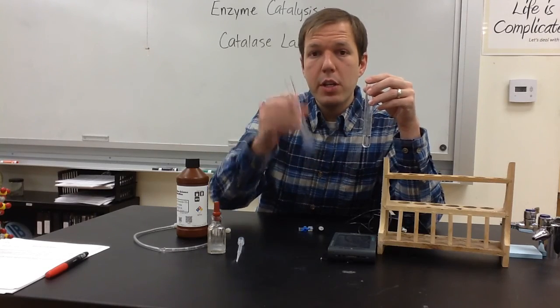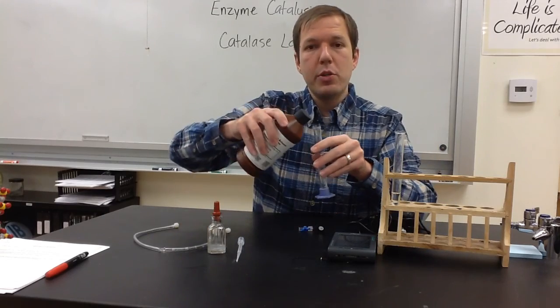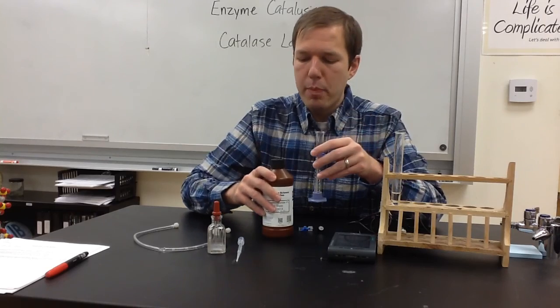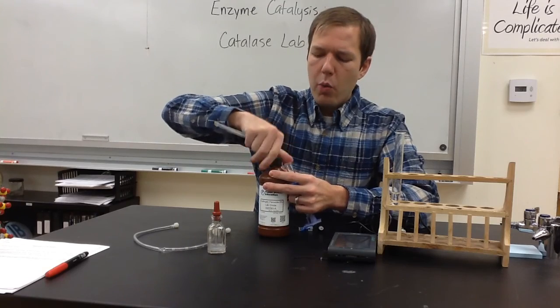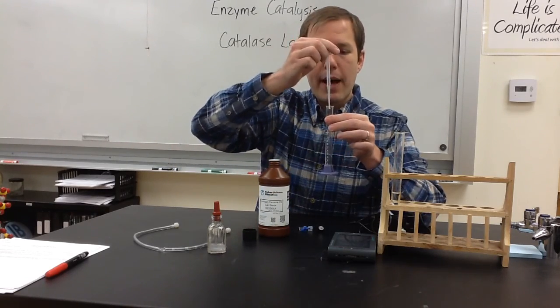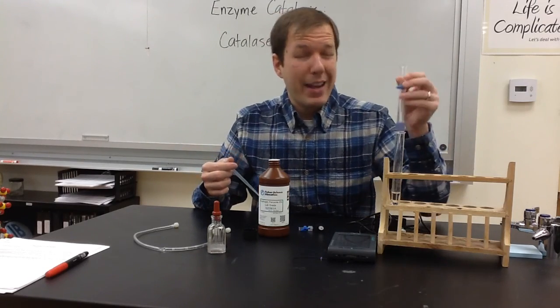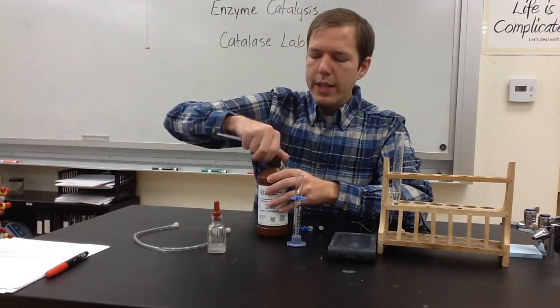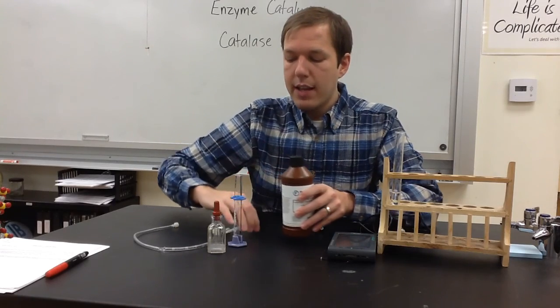So in doing so, you're going to use a cylinder, but remember, it's never a good lab practice to pour into a cylinder and then from that back into the bottle if you pour too much. So instead, make sure you use your dropper bottle so that when you aliquot your peroxide, you can take, using the dropper bottle, into your graduated cylinder, get the volume that you need, and then that can be poured into your test tube.